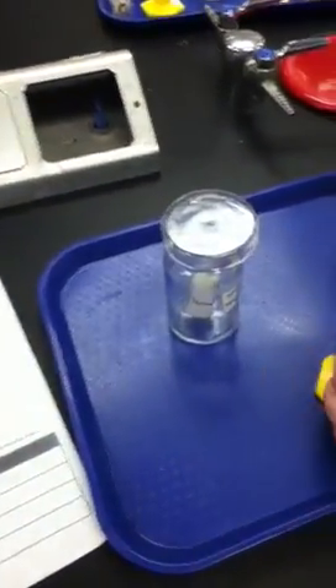Now it's extinguished. And then we put 10 milliliters of lime water.